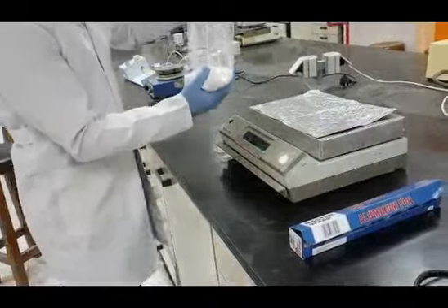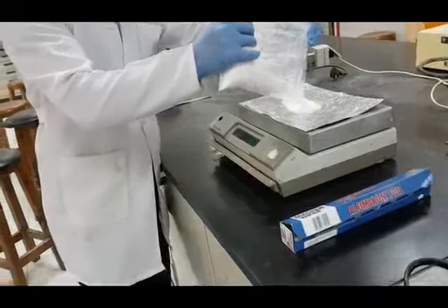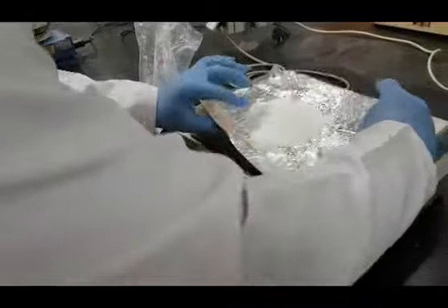First, weigh 100 grams of regranulated granules. Here we are showing granules A as an example.